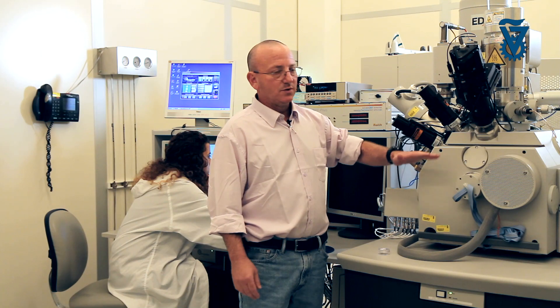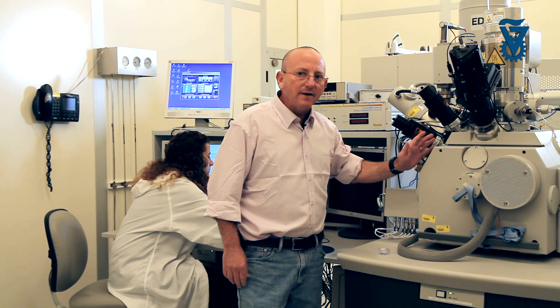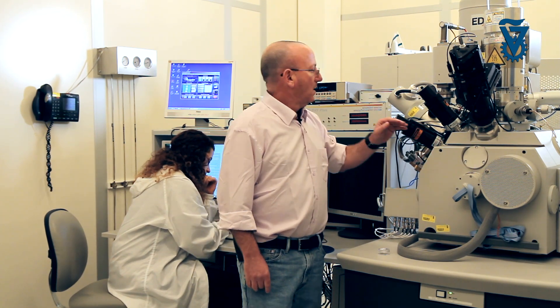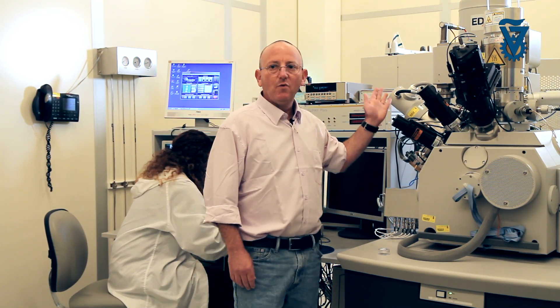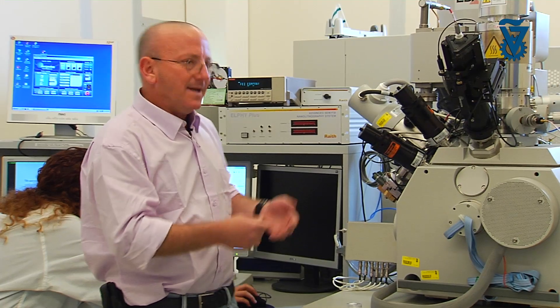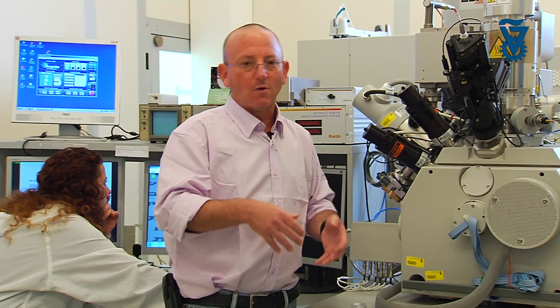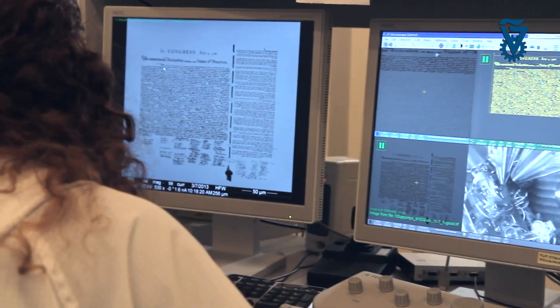The samples are inside the vacuum chamber and the entire system is in vacuum. But this is not just a scanning electron microscope. In addition, we have an ion beam which works in tandem with the electron beam. It's an imaging system, but at the same time we can drill holes, drill lines, or any shapes that we want, and we can also deposit. It basically means that we have a machine shop but at the nanometer length scale.